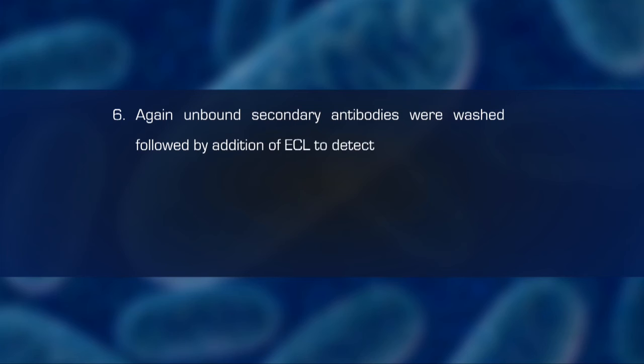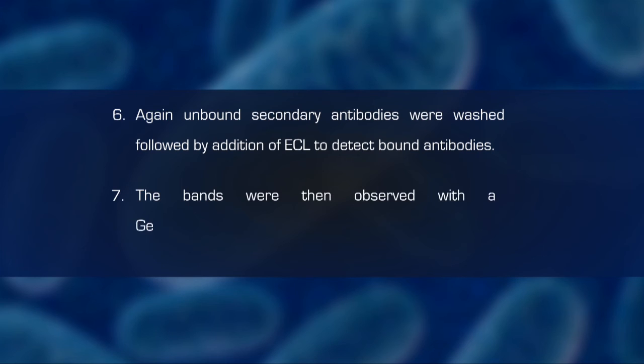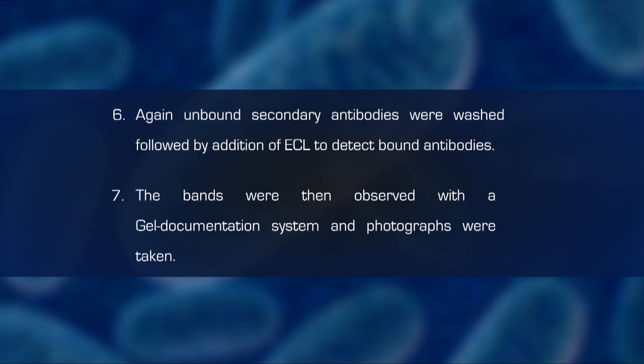Again, unbound secondary antibodies were washed, followed by addition of ECL to detect bound antibodies. The bands were then observed with a gel documentation system and photographs were taken.